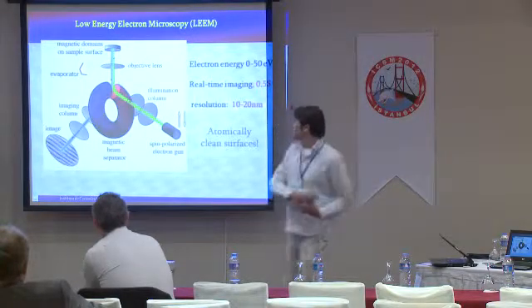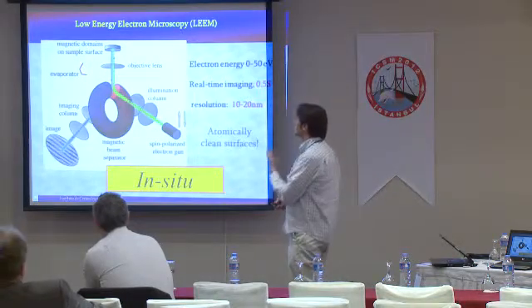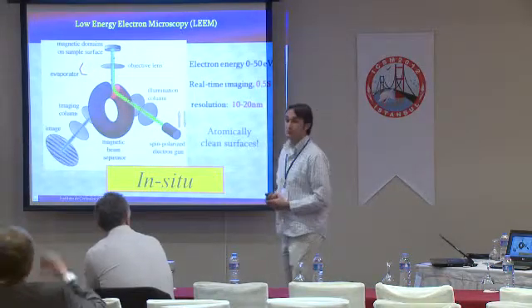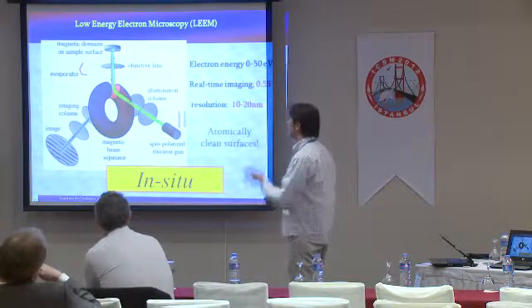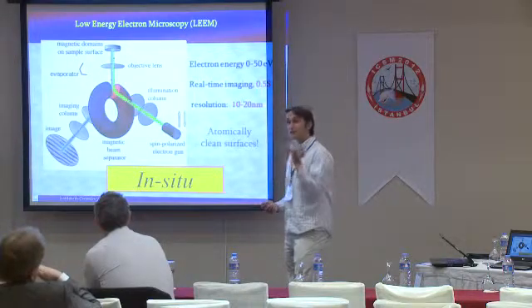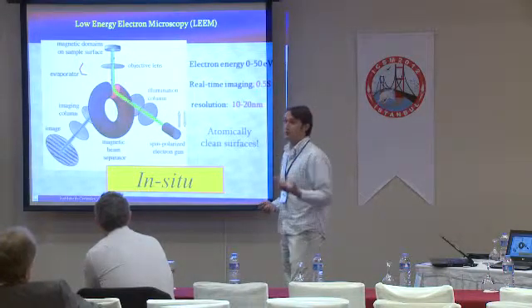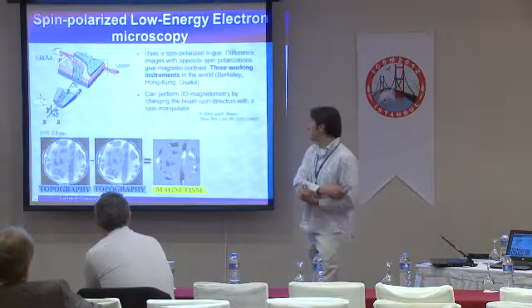So what I just said means that this is a very suitable technique for in situ experiments. We like to grow the sample inside. And actually, the example we did today is one of the few examples where ex situ grown samples were actually successful. It's nice data out of that.